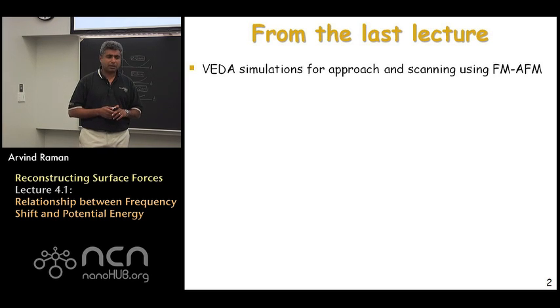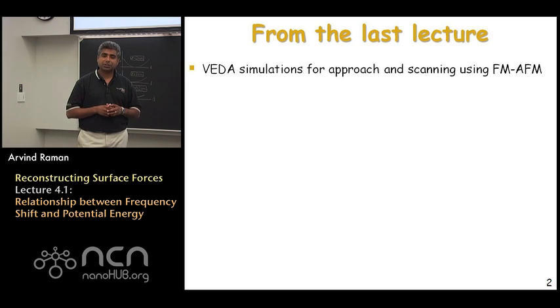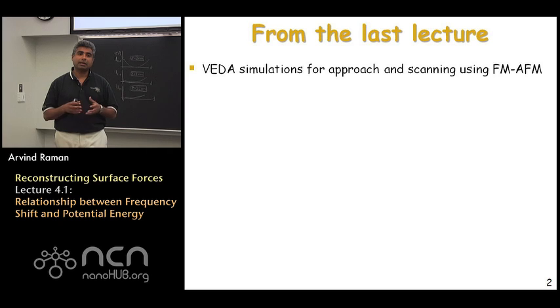This week we're going to focus on a slightly more advanced topic, which is that of force reconstruction. And following that in the last week, we'll move on to application areas where we're going to focus on electrostatic force microscopy, Kelvin force microscopy, AFM in liquids, and magnetic force microscopy. But this week is going to be dedicated to trying to understand mostly details of frequency modulated atomic force microscopy and how we could use that for reconstructing interaction forces between the tip and the sample.